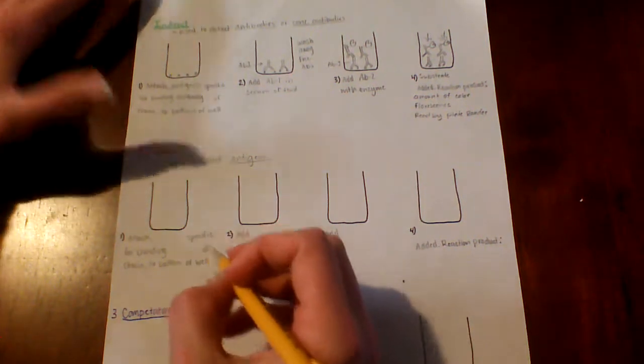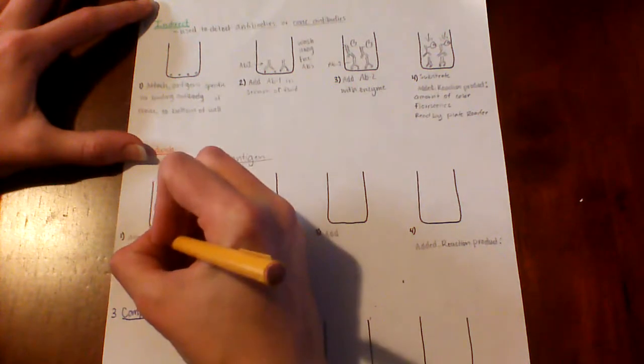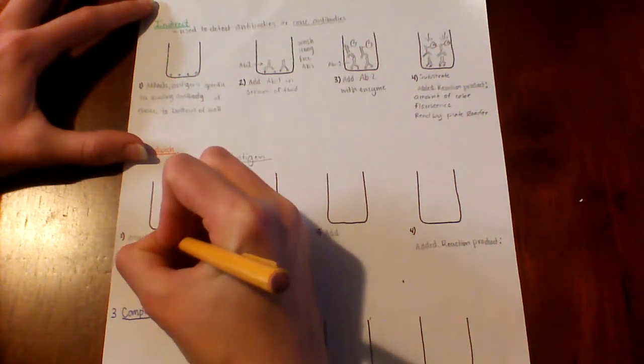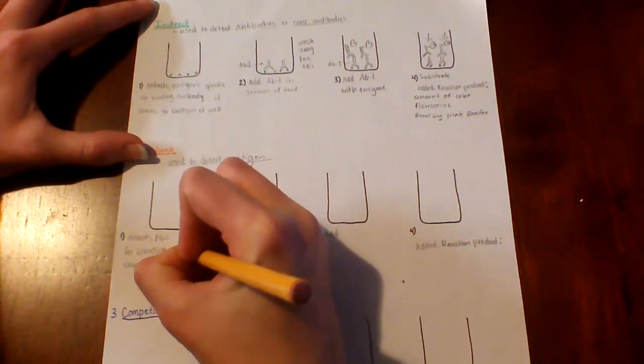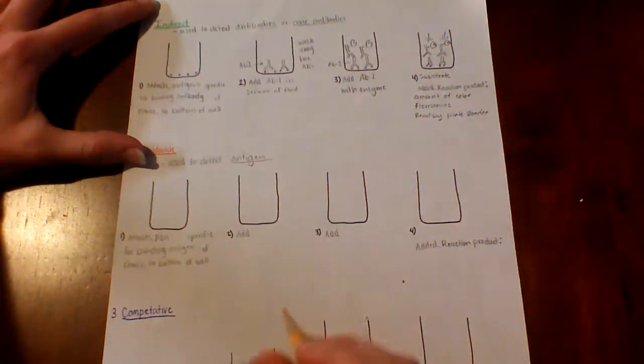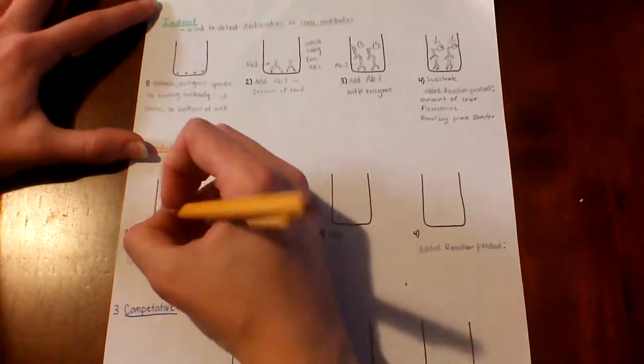You attach antibodies that are specific for the antigen. Just AB. Okay, let me draw those antibodies.